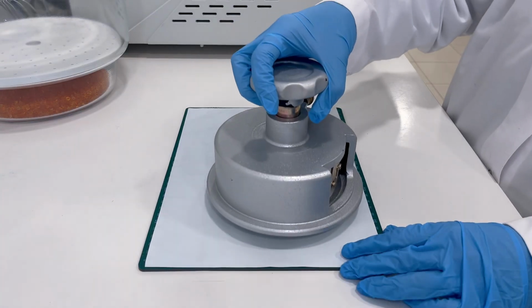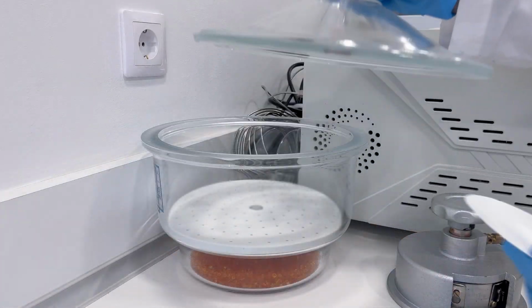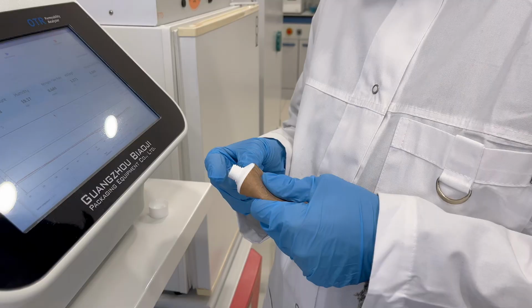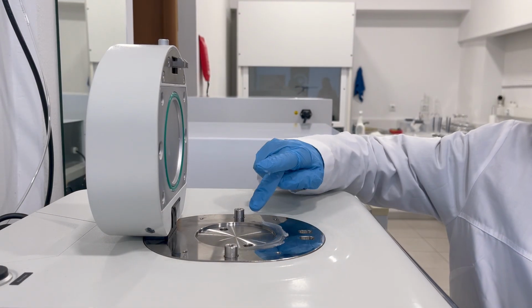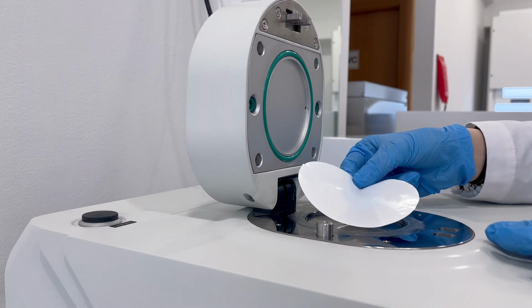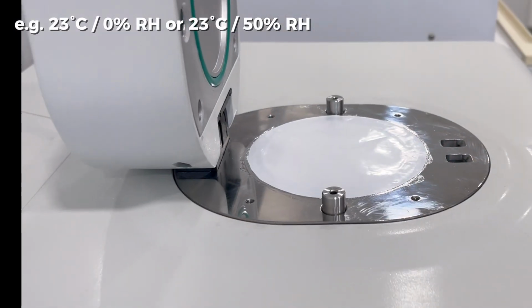To begin, the sample is cut to specific dimensions and conditioned at ambient temperature in a desiccator for at least 48 hours. And the operator ensures that the correct sealant is applied. The specimen is then mounted in the test chamber. Test conditions are selected based on the final application or according to customer requirements.